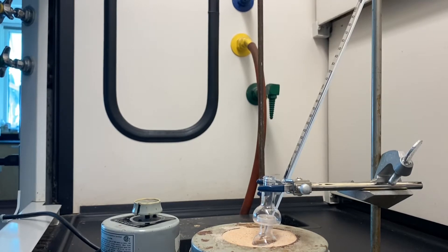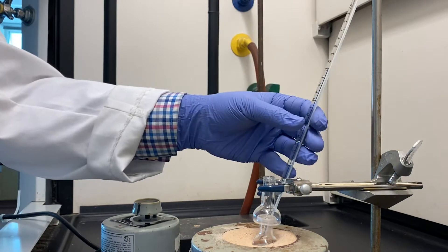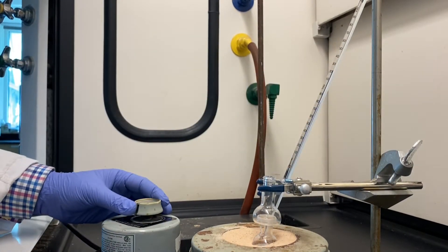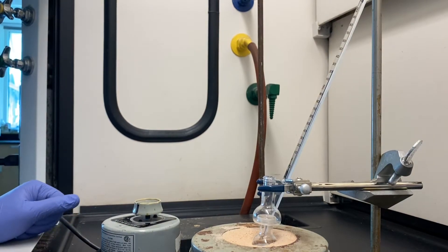In a few minutes, you will see the solution will start to heat. If your temperature is not high enough, consult with your instructor and they may increase the heating setting just a little bit.